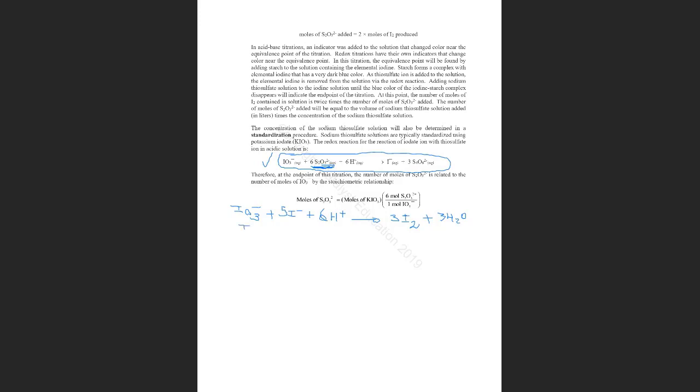You will do the titration of elemental iodine with our titrant until the color disappears.